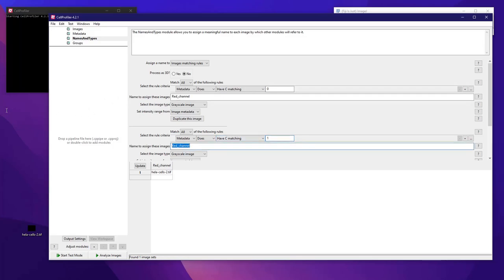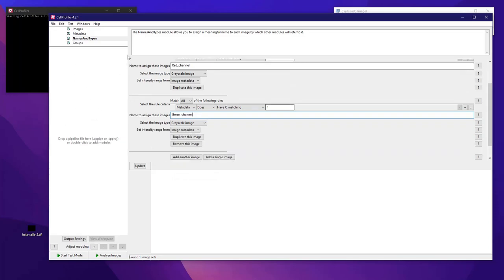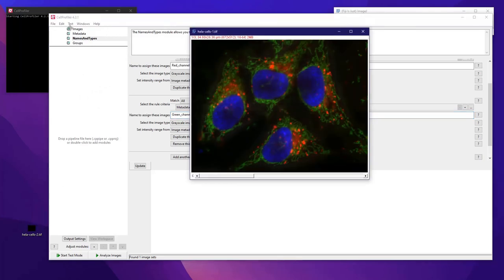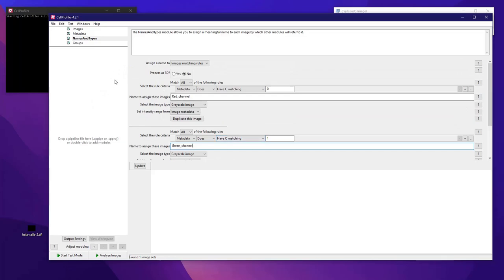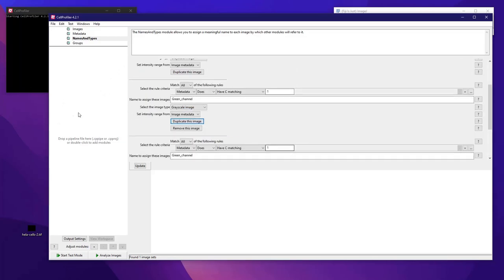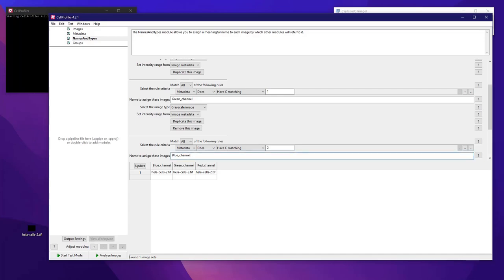We can duplicate this and change the parameter: C matching 1 will be the green channel. I know the order of the channels because I verified by opening the image in Fiji — red is the first, green is the second, blue is the third. So green channel is 1. Duplicate again, and it should be the blue channel. After updating, we have blue, green, and red channels, and the three images have been correctly dispatched.